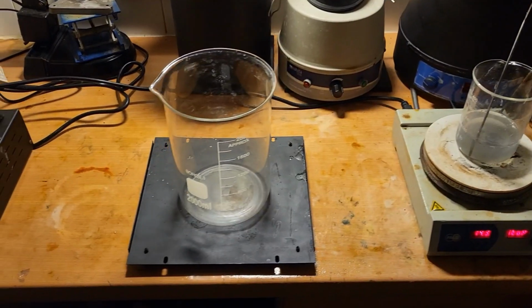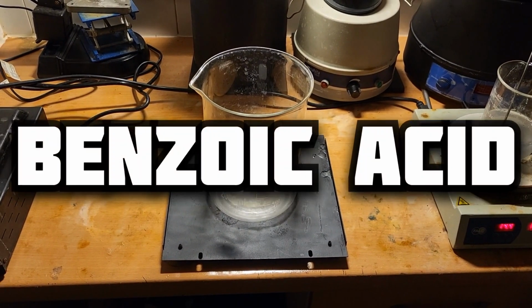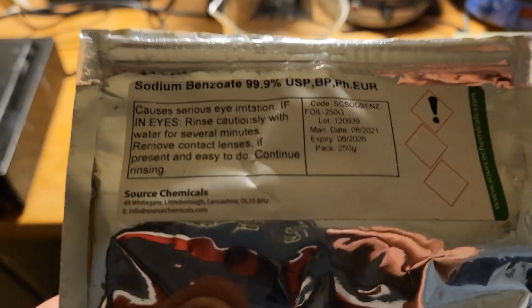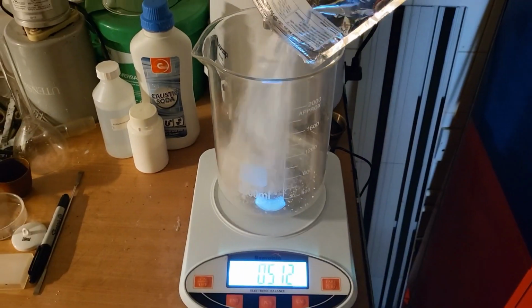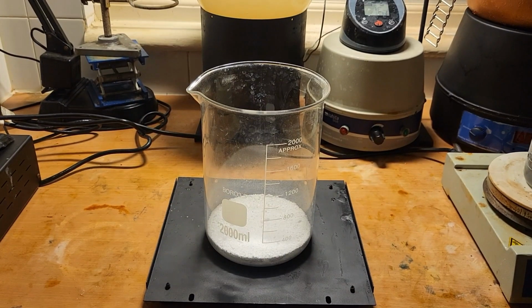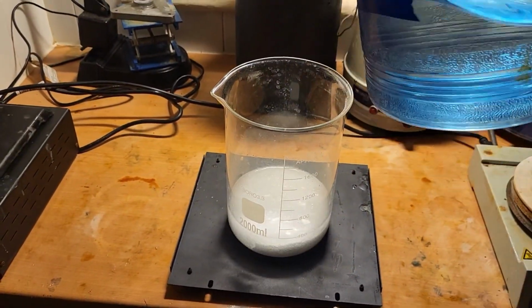Today, we are going to make benzoic acid from sodium benzoate. First, we will put 95 grams sodium benzoate in a 2-liter beaker, followed by 400 mils of water.